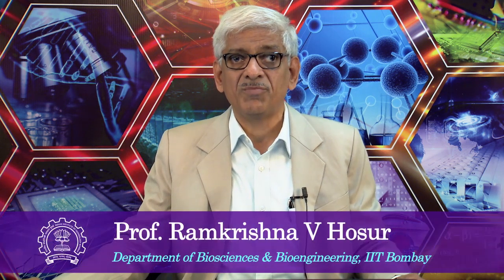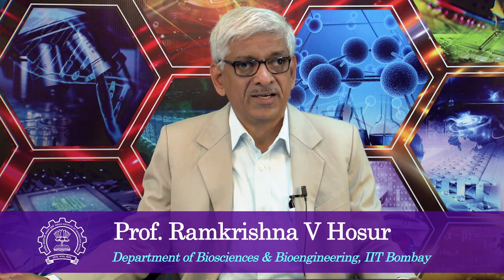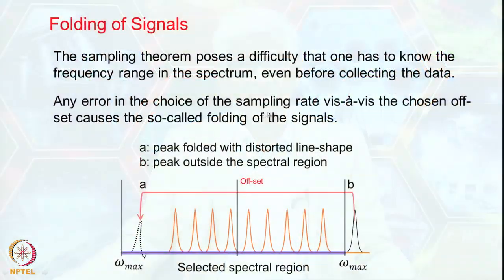In such a situation, the signals which are outside your spectral region get folded into your region of interest, and they appear with a different phase. This is a phenomenon known as folding of signal. The sampling theorem poses the difficulty that one has to know the frequency range in the spectrum even before collecting the data, and this is not an easy thing to do, and we can get into trouble if the choice is not proper. Any error in the choice of the sampling rate vis-a-vis the chosen offset causes the so-called folding of the signals.